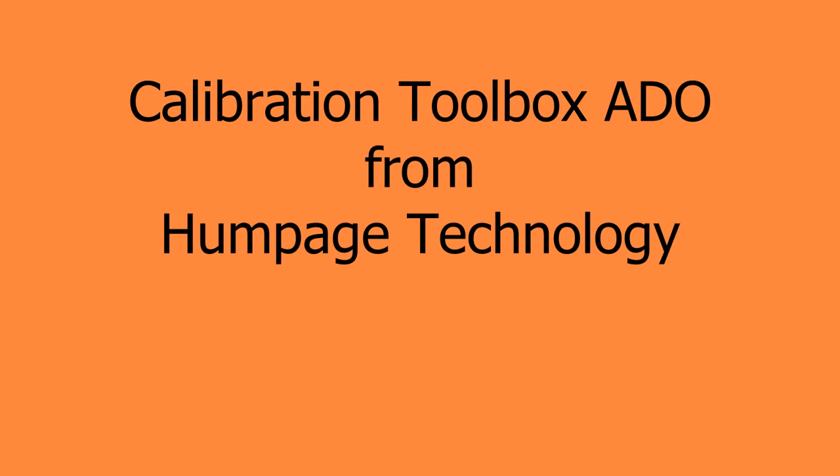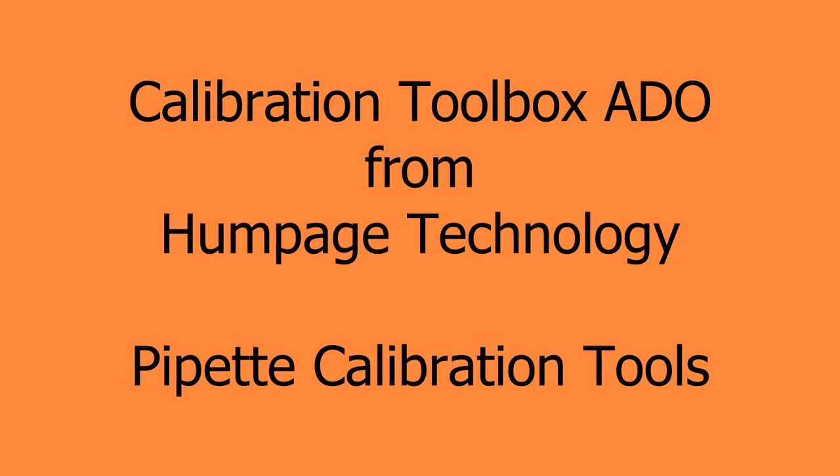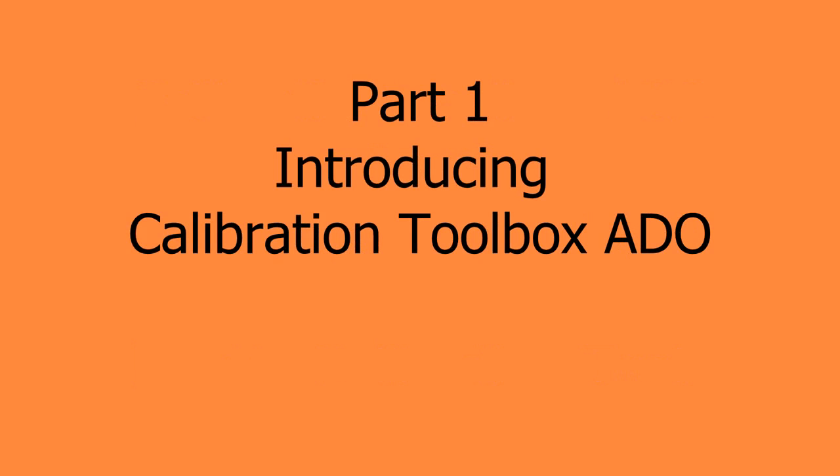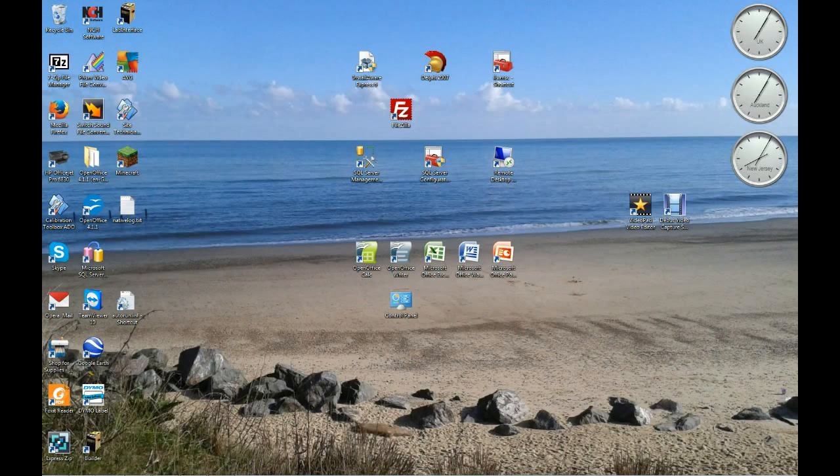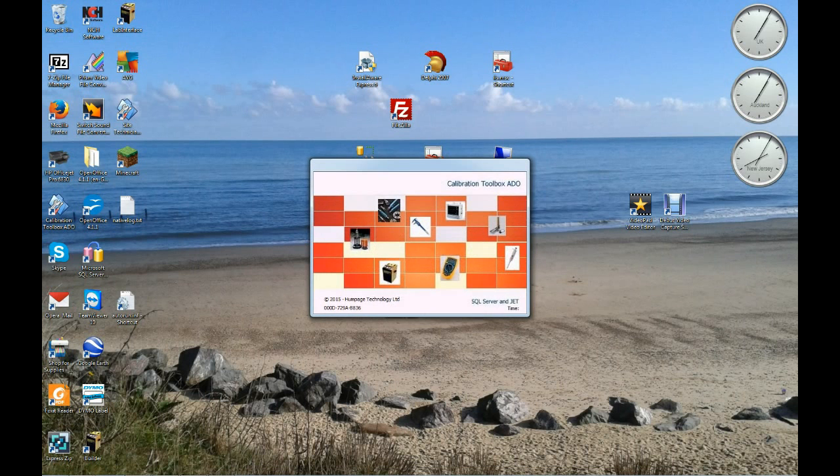Welcome to this series of short video tutorials on Calibration Toolbox ADO Calibration Management Software. In this tutorial we're going to concentrate on the Pipette Calibration Facility. This enables you to calibrate pipettes efficiently, accurately, quickly and easily.